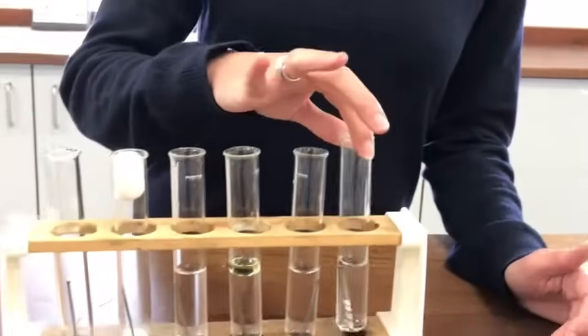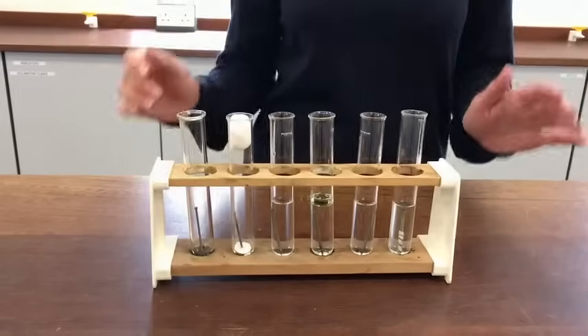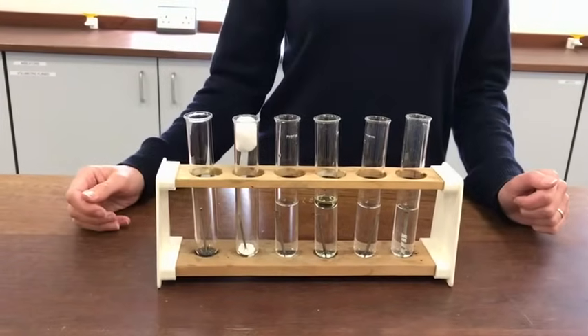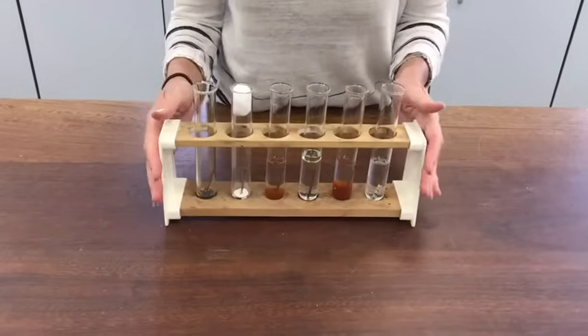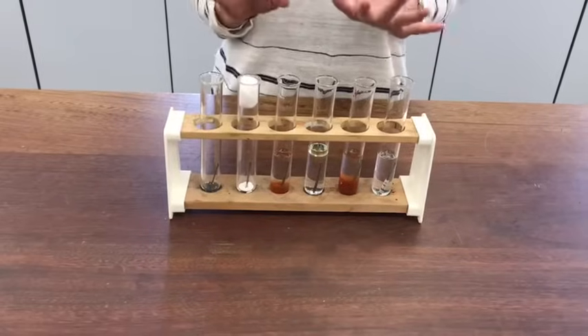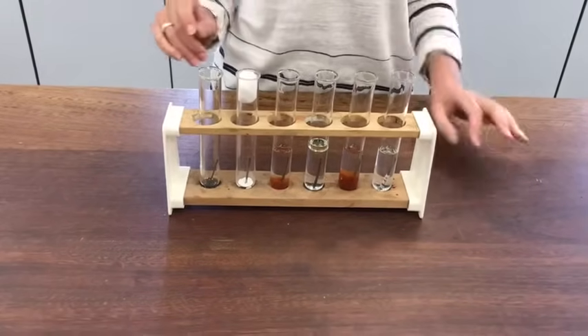We're going to leave those for around a week to two weeks and see what happens to them — which ones go rusty and which ones manage not to go rusty in that time. So it's 12 days since I set up this experiment and you can see that there's very definitely been something that's happened in some of the tubes.